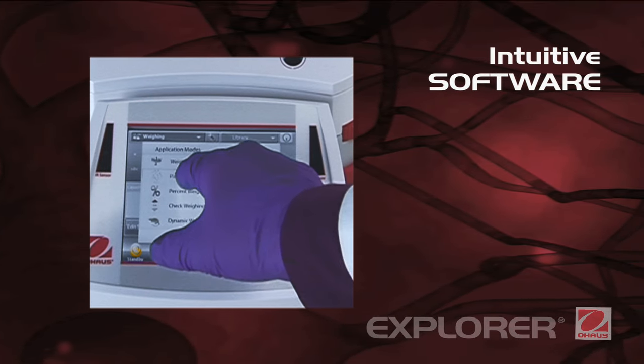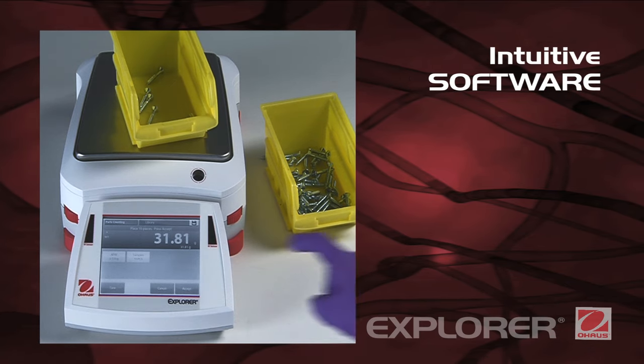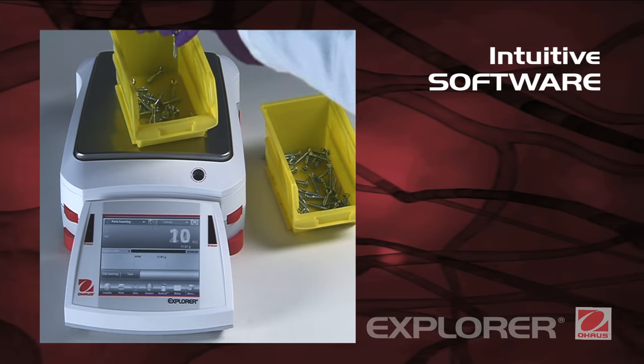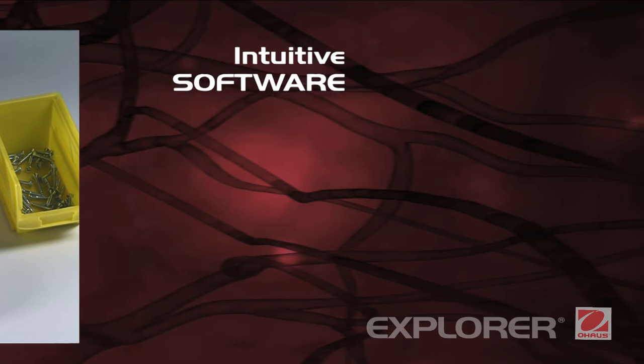Intuitive software. SmartTex 2.0 is O-House's easy-to-use graphical software featuring 14 applications, QWERTY and numeric keypads, and minimum weight indication.